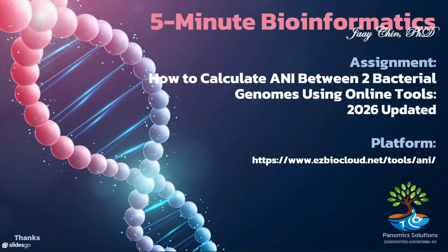Today, we're going to explore the online Average Nucleotide Identity, or ANI, calculator provided by CJ Bioscience. If you're working with prokaryotic genomes and need a reliable way to classify or identify bacteria, this tool can be incredibly useful. So first, what is ANI?